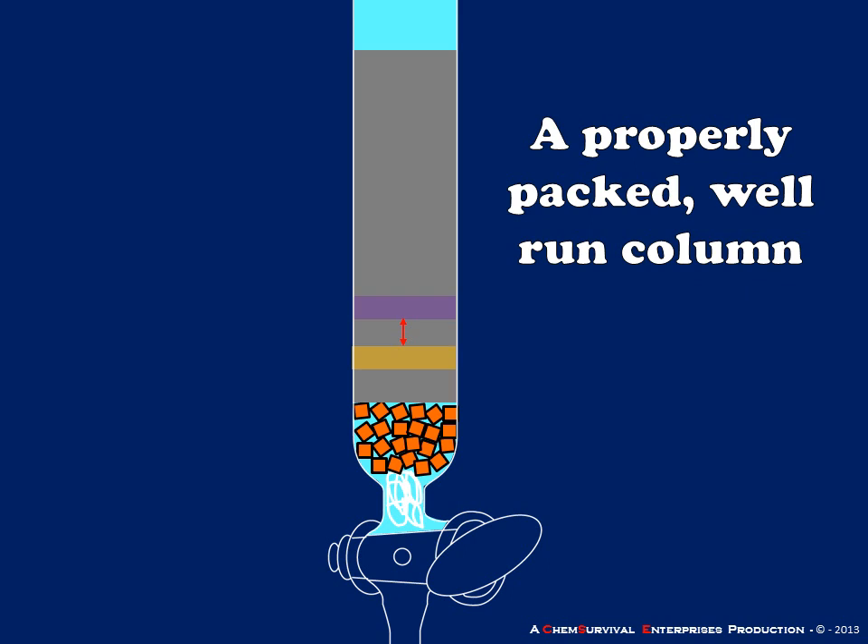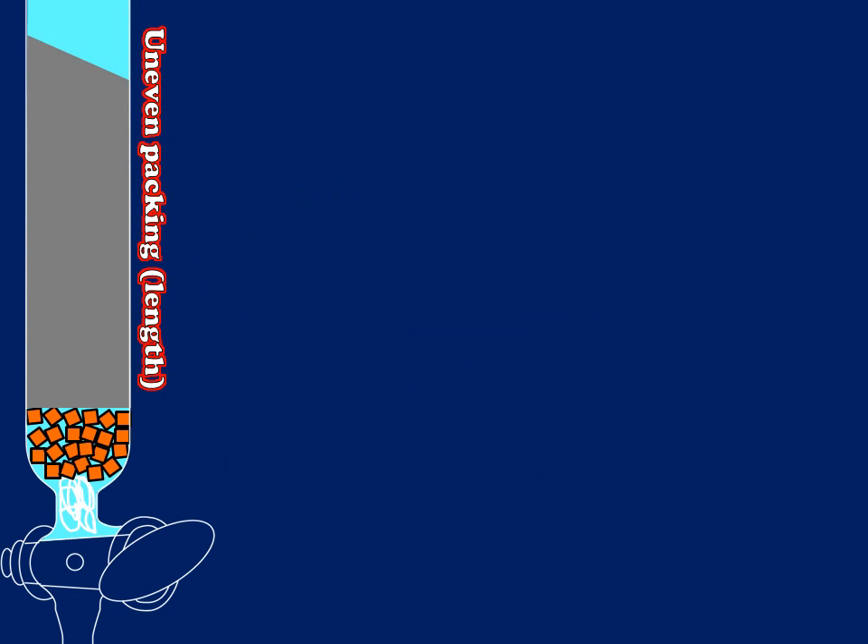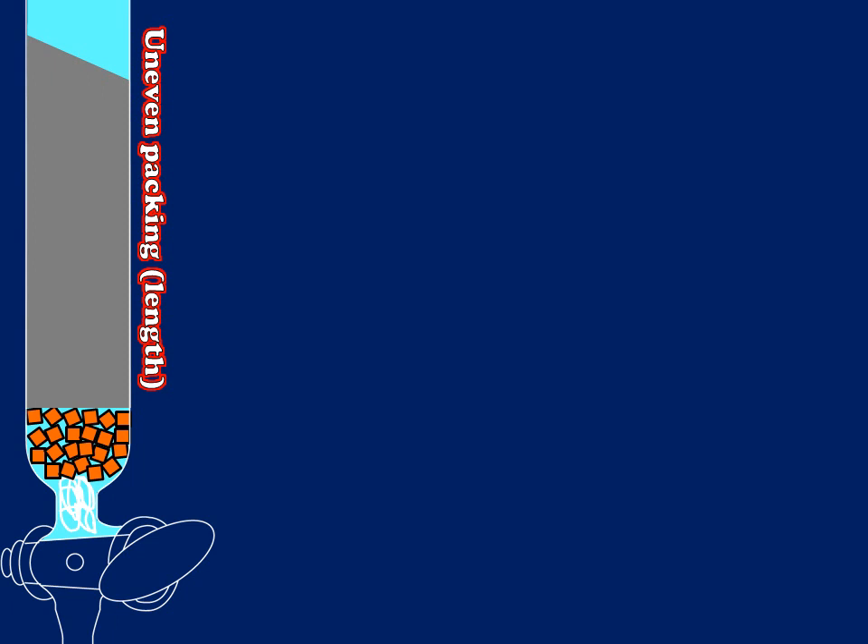If these two bands are not separated from one another, then my compounds are not separated. We want a column of uniform length, width, and density, with a narrow concentrated band of analyte loaded. Let's look at the potential impacts of not having these requirements in place. First, an uneven packing: here I have a column where the top is not evenly packed — there is a shorter path length on the right-hand side versus the left, so the bands on the right will travel farther than those on the left in a given amount of time.